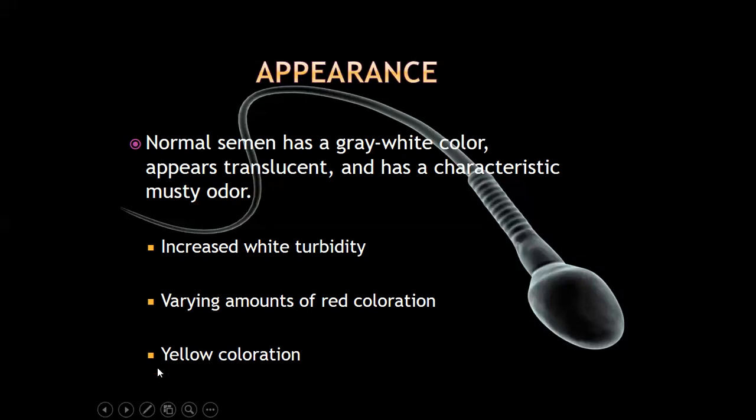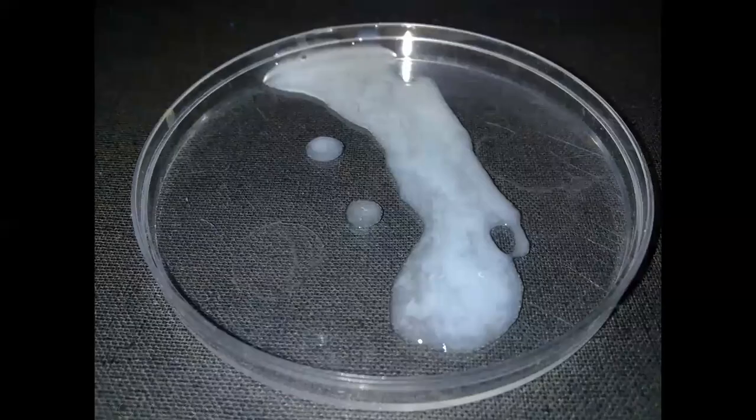Take note, urine is toxic to the sperms, so it will cause a falsely decreased sperm concentration result. So this is how it would look like: gray-white translucent fluid which has a musty odor.